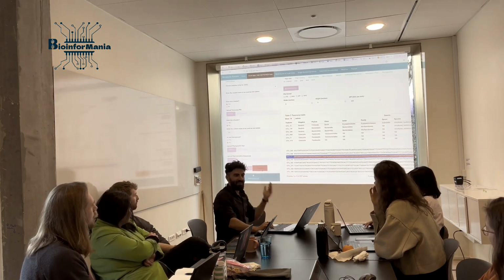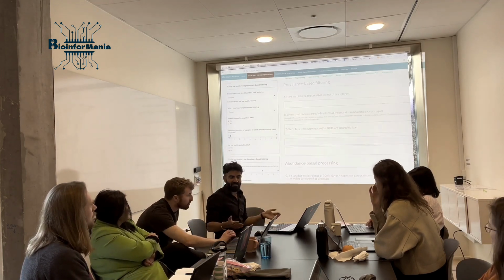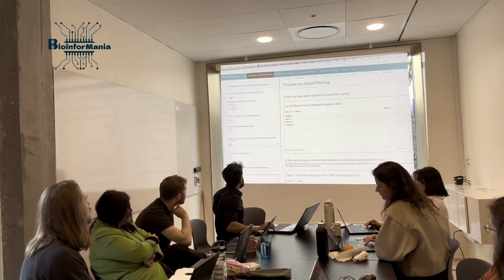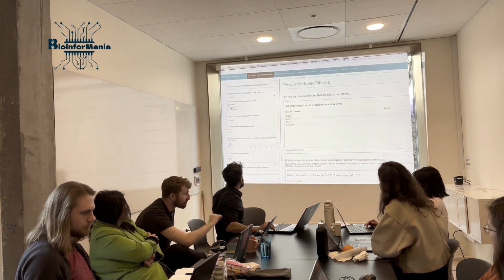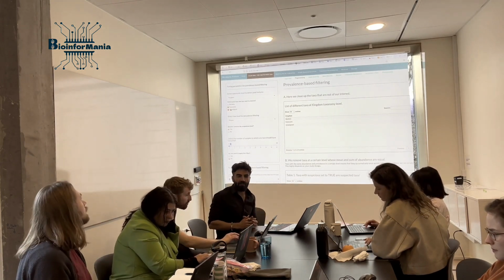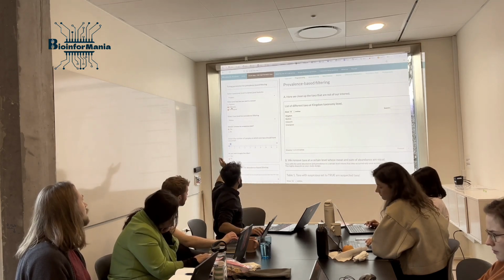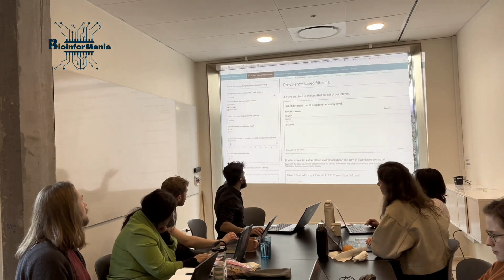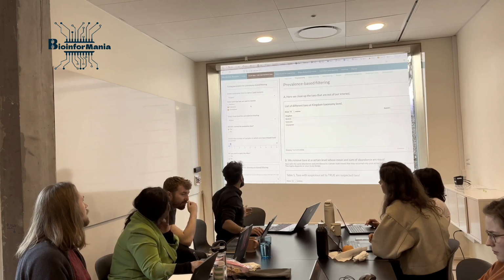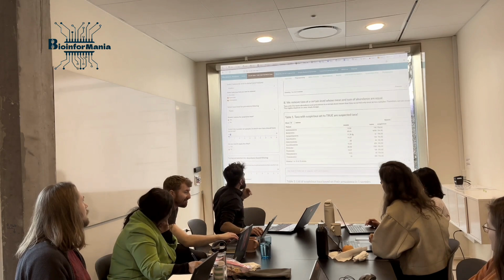Anyways, now that we are ready, we see how our data looks. Now we actually start our pre-processing, which is very hefty and tedious and a little bit risky job, risky business. The first thing that we do here is we do a raw cleaning. This is a 16S data, meaning that it's only for bacteria. So I select those who don't belong here. This is misclassification, misassignment. This is error. Eukaryote, unassigned, remove it. Okay? Keep bacteria by deselecting. That's how mine works.